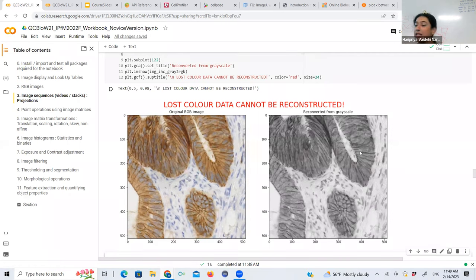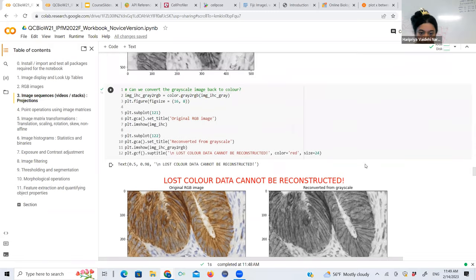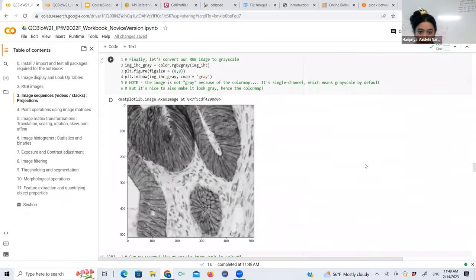And that's why all it does is just divide them equally, because that's the simplest thing it can do. And I told you, if you divide something equally between red, blue, and green, all you get is shades of gray. So that's why. Did that make sense? Howdy.